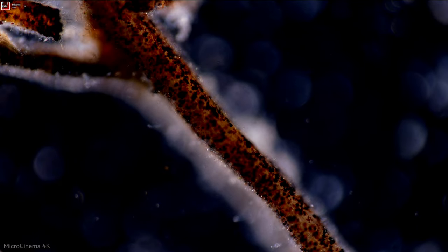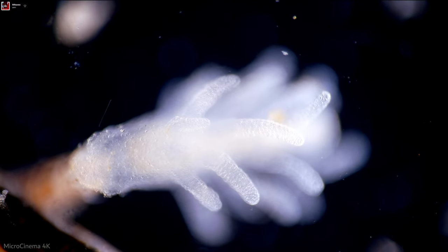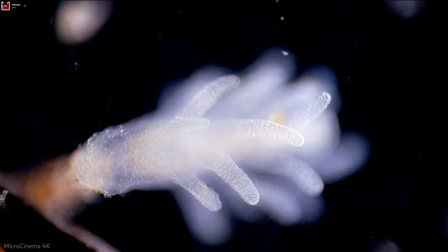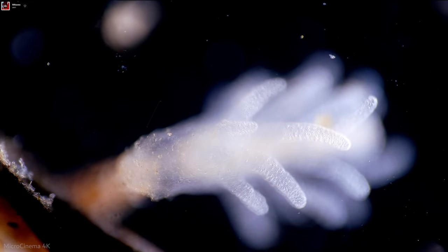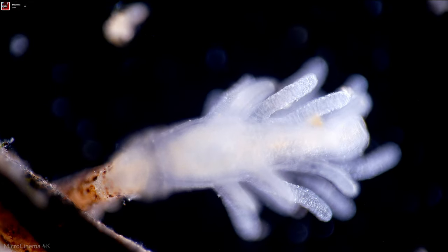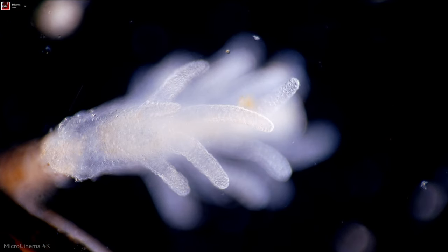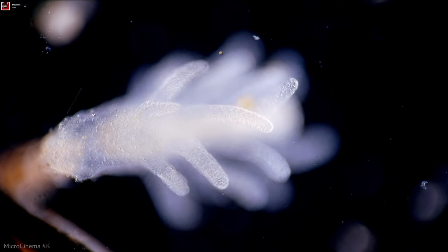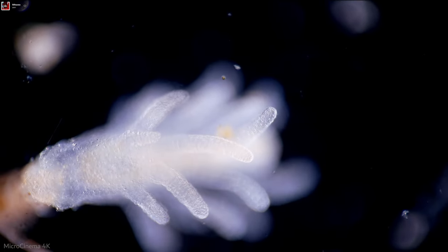So I don't know, I think this is some kind of sponge or coral or something. I just don't know. But we'll see. I'm sure one of the people on the Discord or Pacific Plankton, somebody can figure out this thing. Strange little, maybe it's some kind of worm? But again, it doesn't move at all. And it never moved, even when I was in the jar. I don't think it's dead or anything like that. Or maybe it is dead, I don't know.